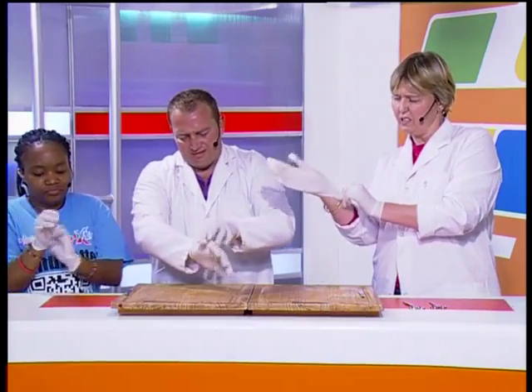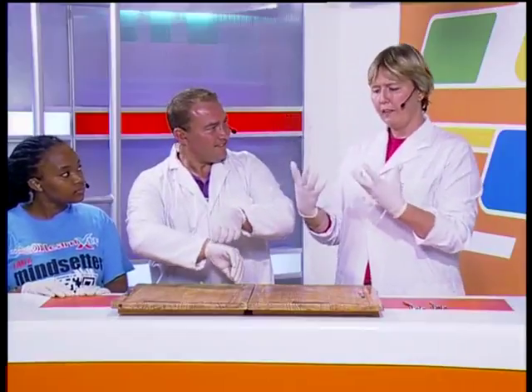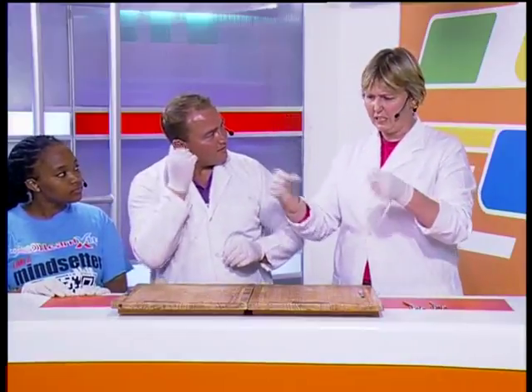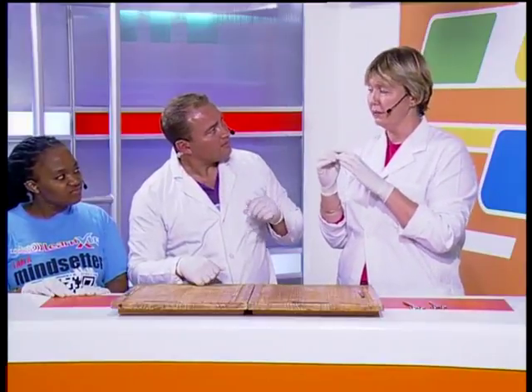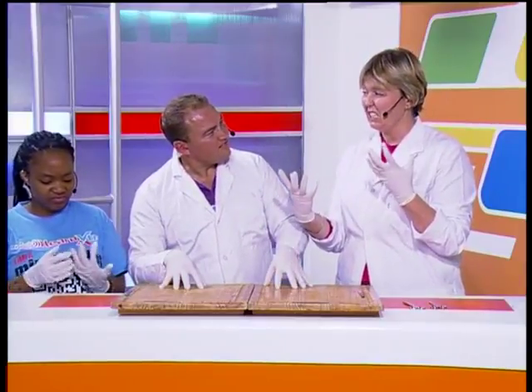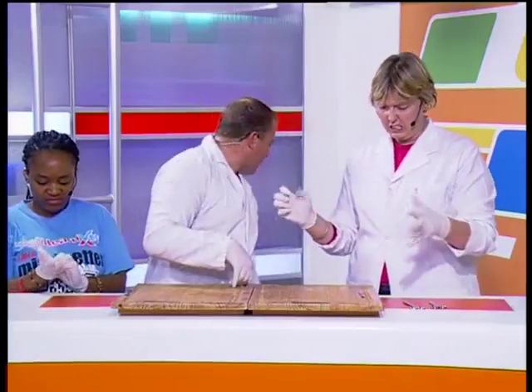The other reason, I was told, especially for girls, is that if you're touching things like blood and skin and all that, where there's been blood, you can get something trapped under your nails. And if you forget to clean it out, that's not going to be nice. So this protects you from getting sick as well.